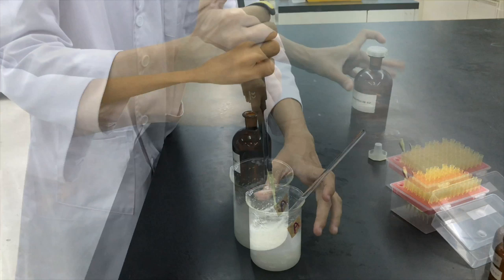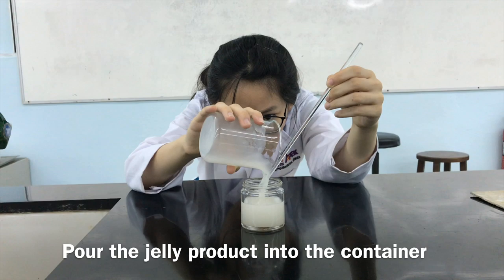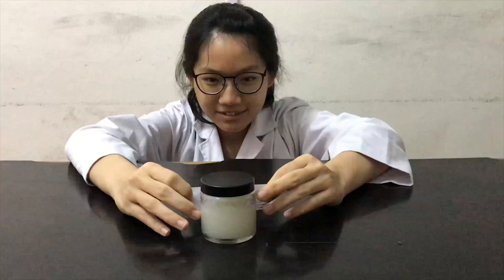Stir the mixture by using the glass rod. Pour the jelly product into the container until the calibrated line is reached and cap the container. Label the jelly product accordingly and our ephedrine sulfate jelly is done!